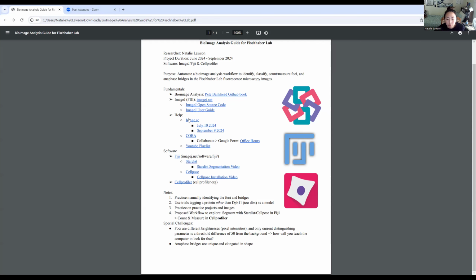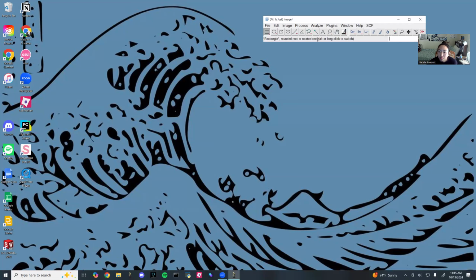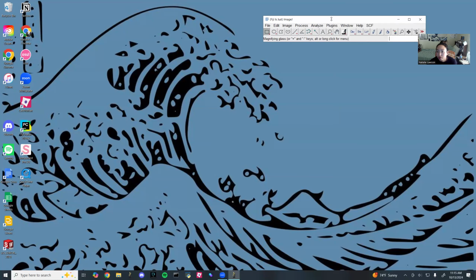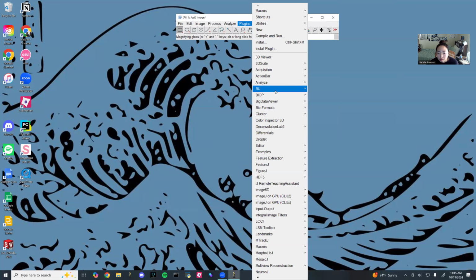So now let's open up the actual softwares. Okay, share my screen. So this is Fiji, and I'm going to open up an image. I'm just going to show you the interface of these things, and I'm not really going to go through any processes because I think the YouTube tutorials I provided are enough. But I will show you how to open these images.